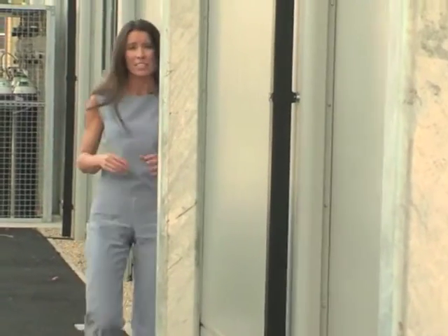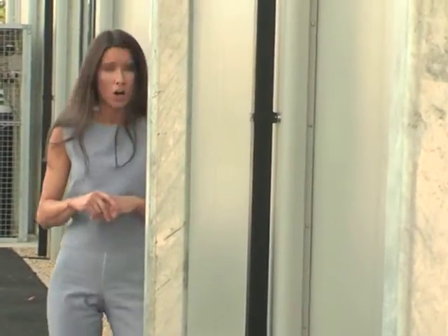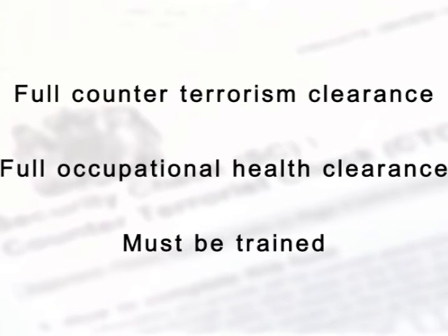Access to a Level 3 or 4 biosafe or biocontainment laboratory and its facilities is restricted to authorised and competent personnel only. In the UK and at VLA, staff must have full counter-terrorism clearance. They must have full occupational health clearance to work with flu and skin and respiratory sensitisers. And they must be trained to work to relevant standard laboratory operating procedures and risk assessments. It's the responsibility of those using the laboratories to ensure that they're fit and well and capable of working safely, not just for their own protection, but for that of other users.